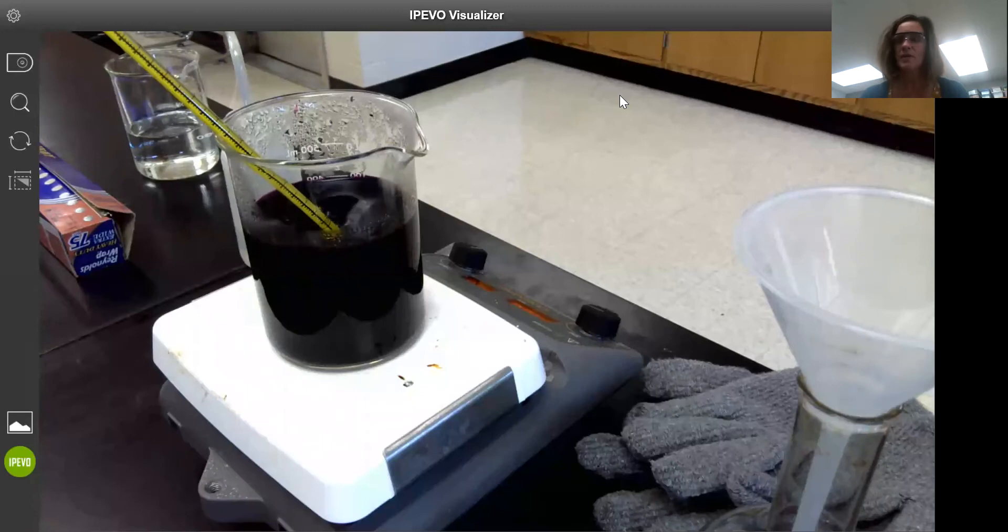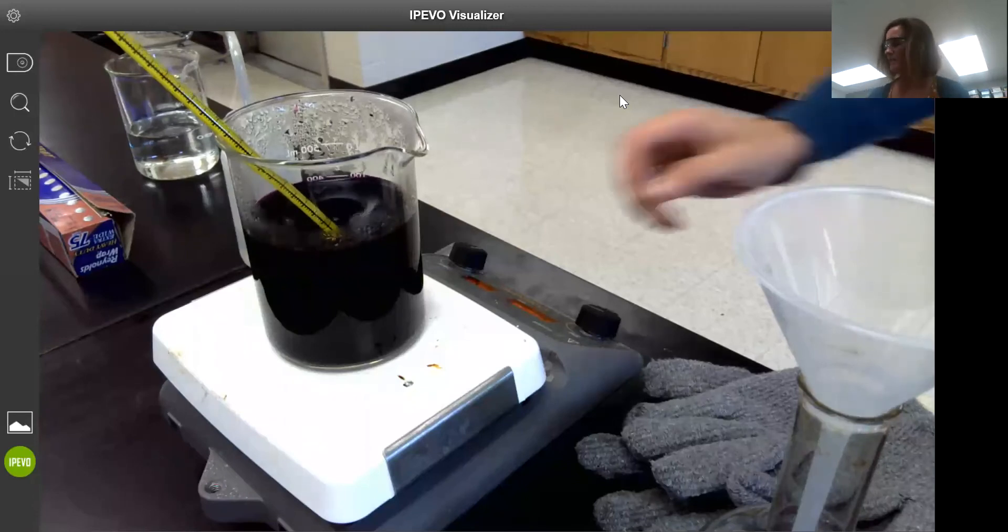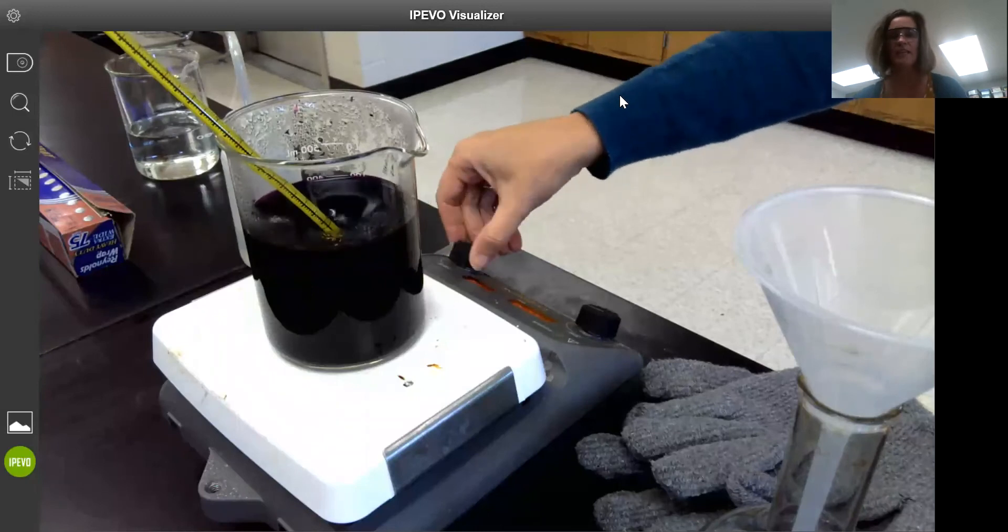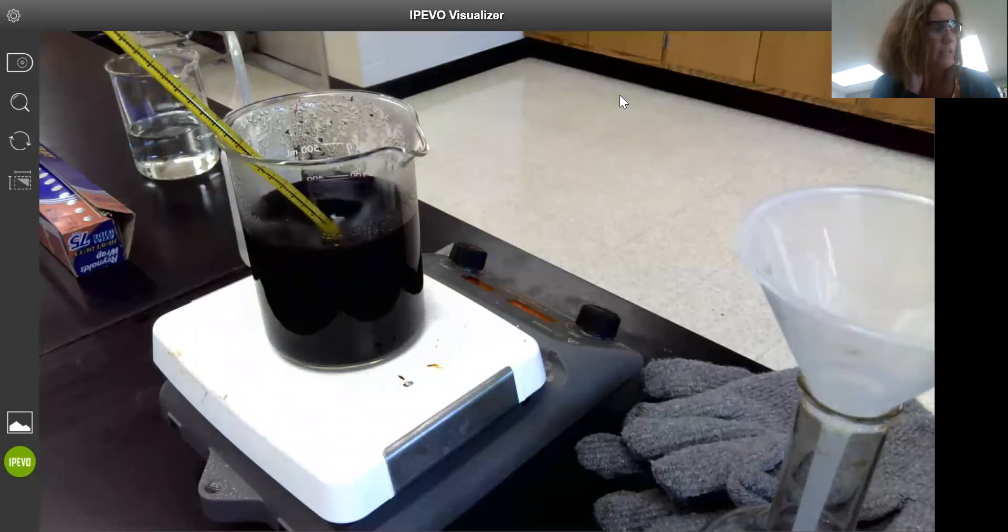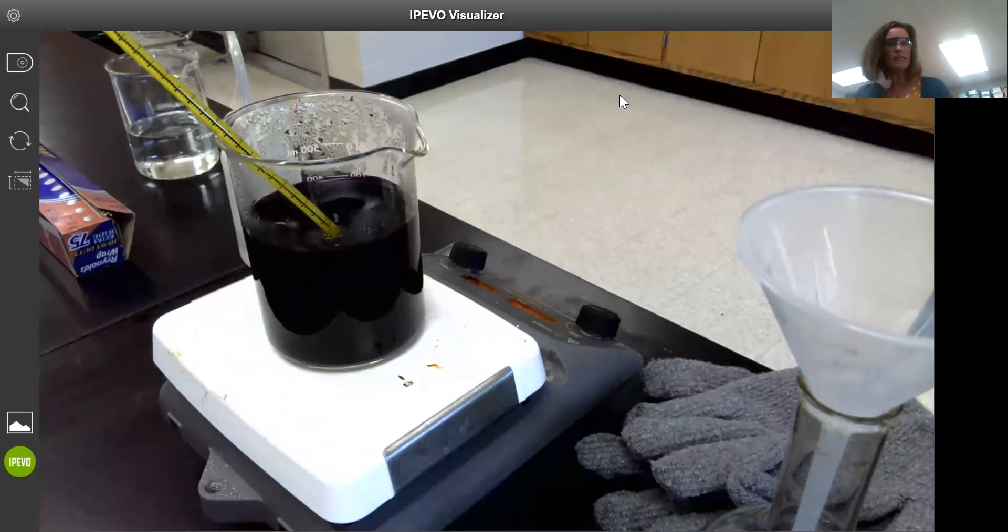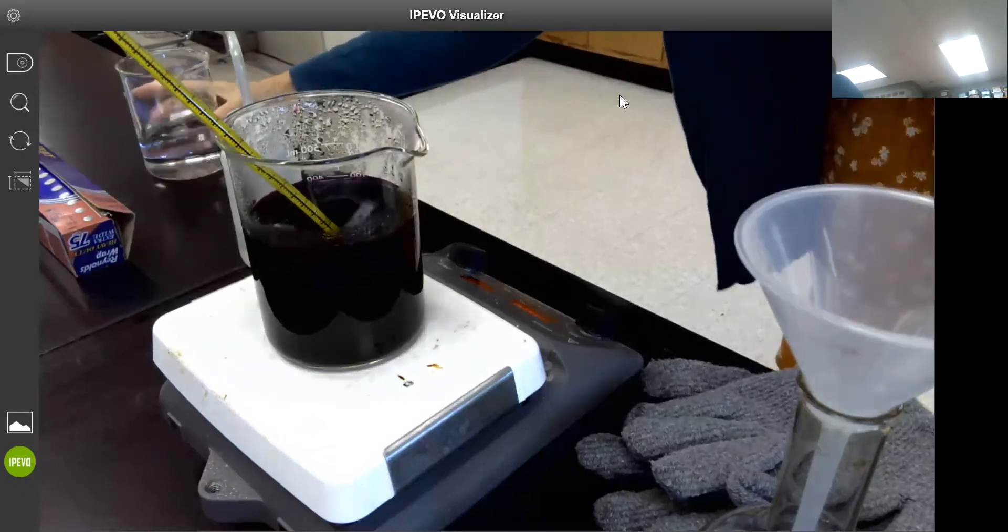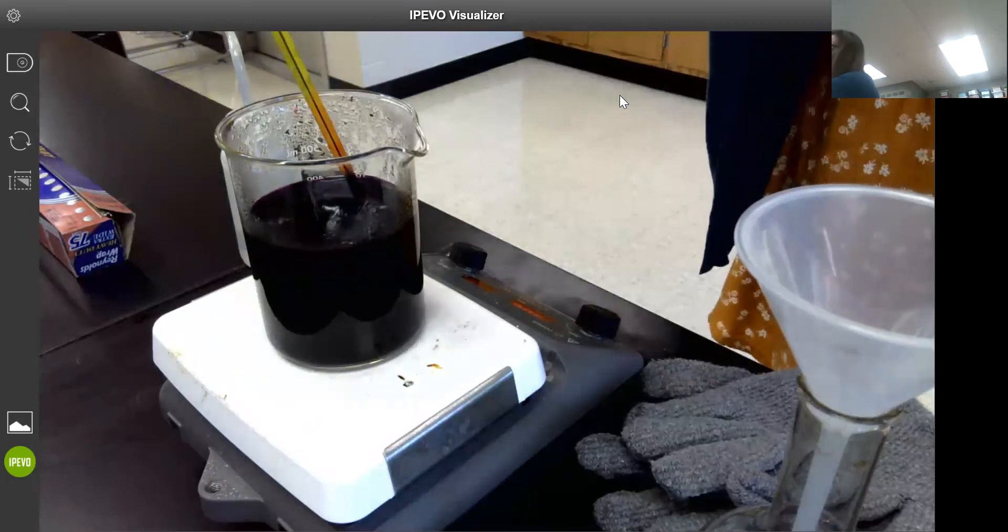The KMnO4 solution has now reached a temperature of 90 degrees, so I'm going to turn off the heat. According to our instructions, I'm going to add some more deionized water to take this up to an approximate volume of 500 milliliters. I'm going to get my thermometer out of there, I don't need that anymore.